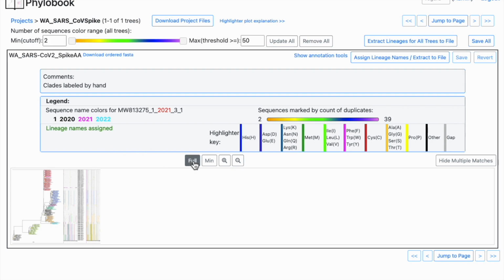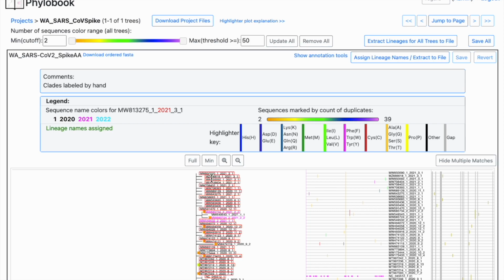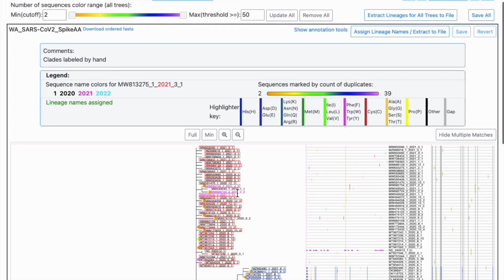And so if we zoom in on this, what we'll see is we have some GenBank IDs, and then I've collected sequences and I've named them based on the year and month in which those sequences were found. So 2021, January, February, March is 3. February 2021, there's a 2021, February 2021, January 2020, the 11th month, etc.